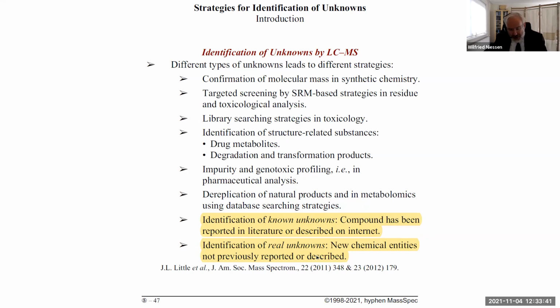While I was looking at it, they did some NMR work, so they came up with an alternative structure. In the same way, I could explain the fragmentation from this alternative structure. And so most likely the alternative structure was the correct one. So this is something which I will illustrate with two examples.